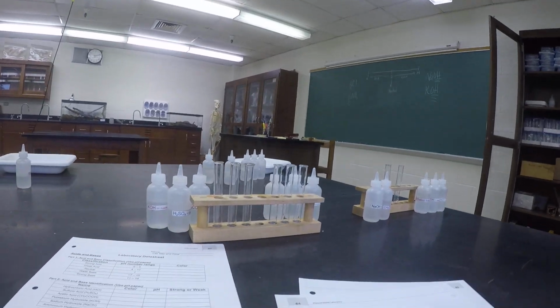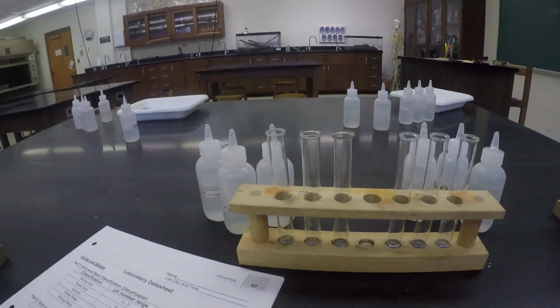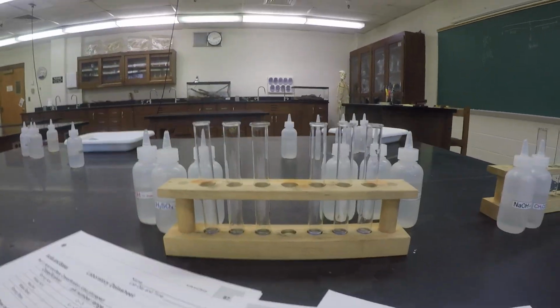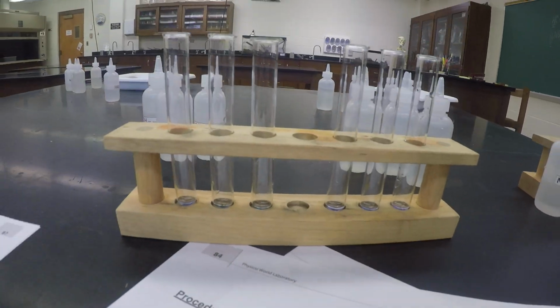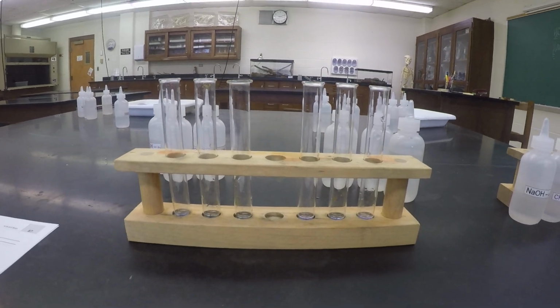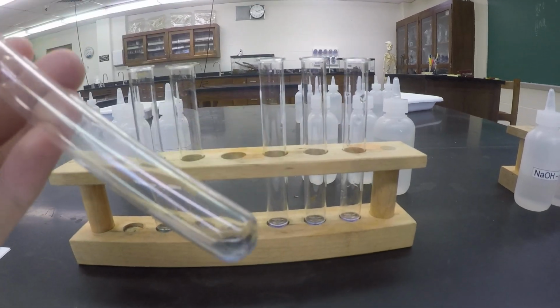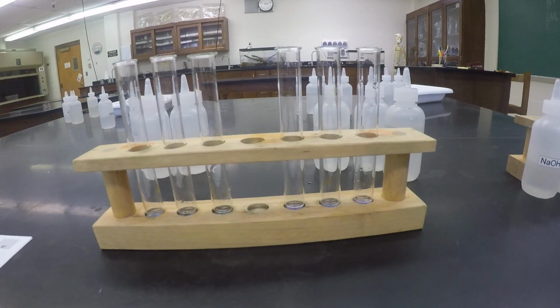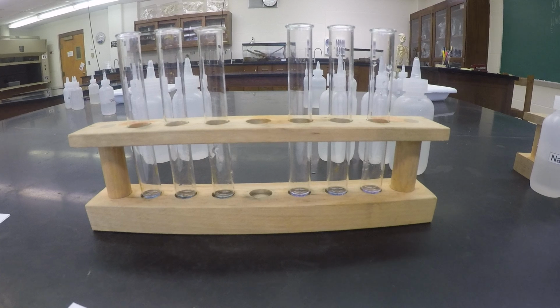Our next experiment involves looking at a naturally made pH indicator. So this morning I came in and I made cabbage extract by boiling red cabbage leaves. And by boiling red cabbage leaves, I'm left with, I don't know if you can see, there's like a purple water. So the dye comes out of the purple leaves and you're left with a naturally made pH indicator dye.